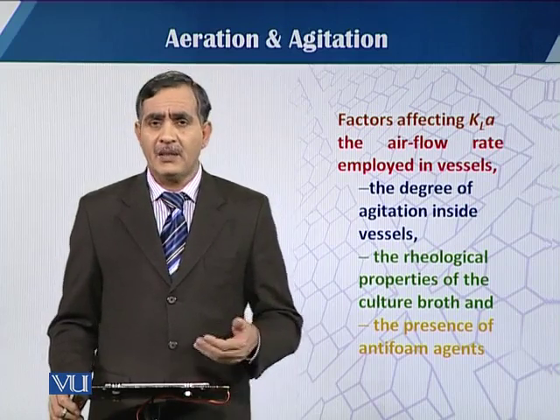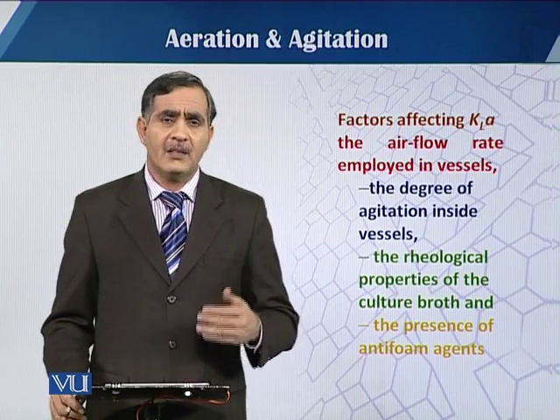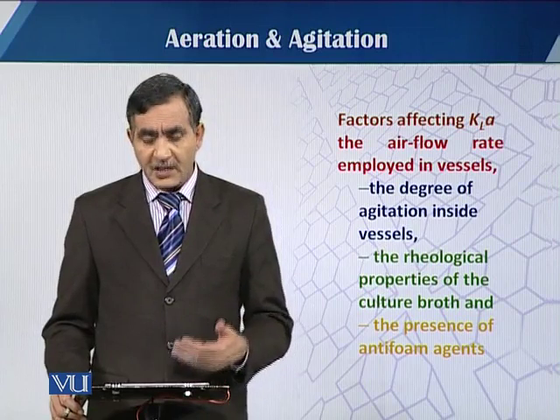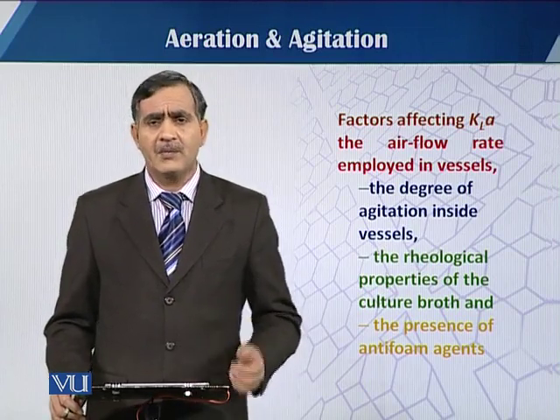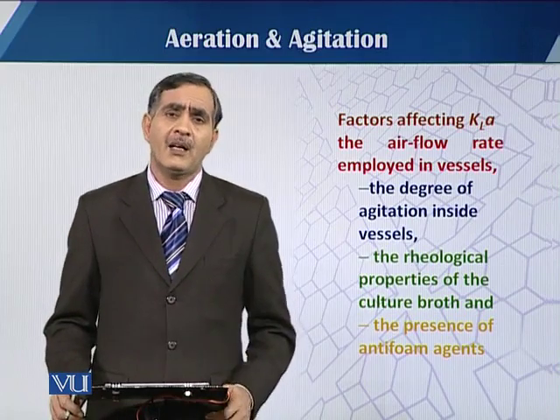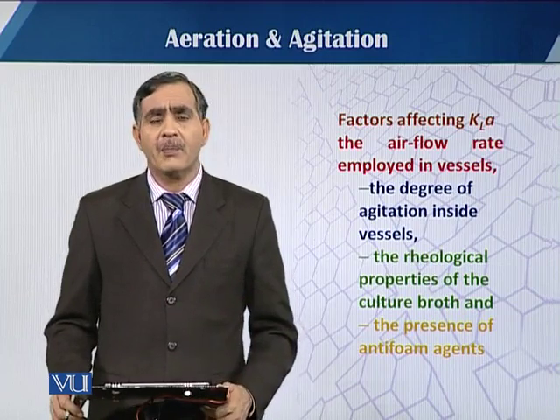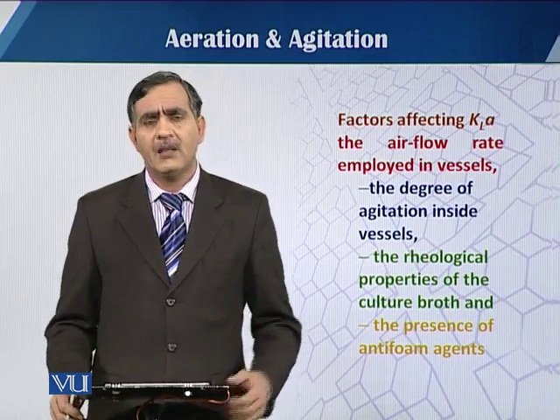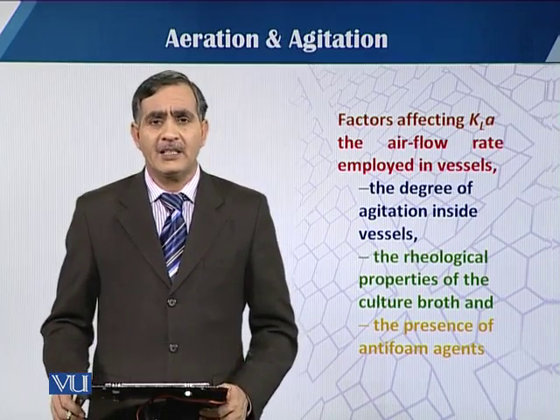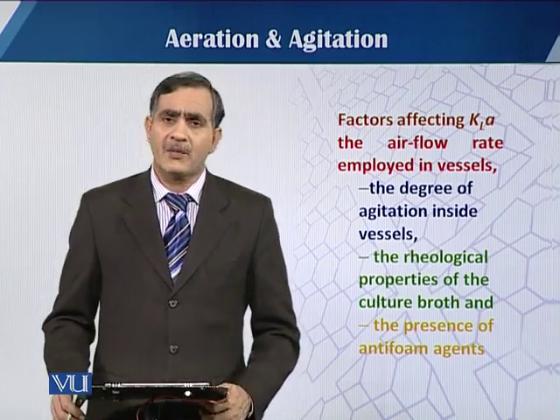So KLa varies with the agitation rate and with the nature of the fermentation medium, and how that behaves. Sometimes it is also affected when growth happens, because then the rheological properties of the medium change, and also by the type of antifoam. So this is all about aeration and agitation, and the role of aeration in aerobic fermentations.